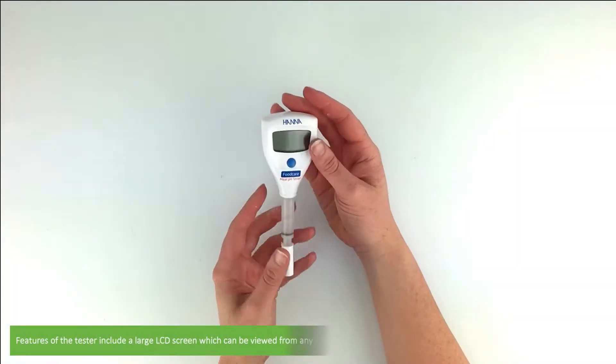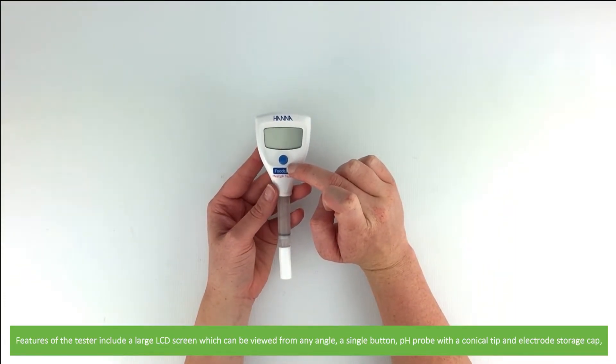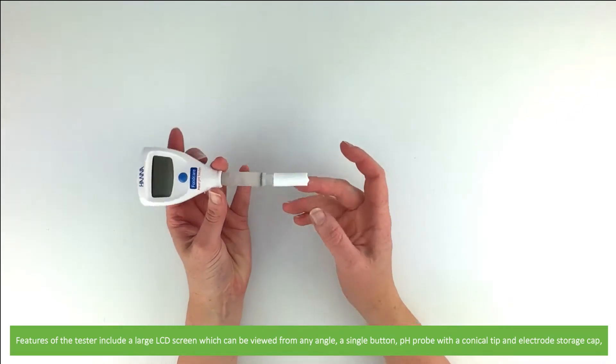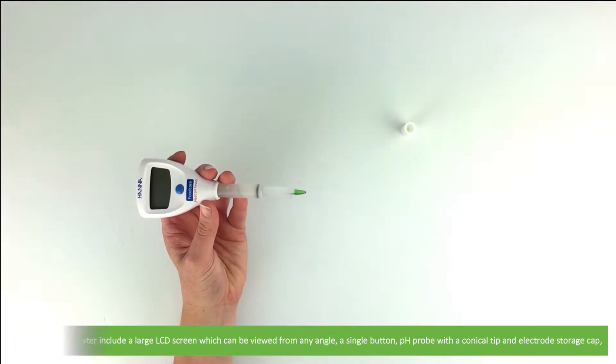Features of the tester include a large LCD screen which can be viewed from any angle, a single button, pH probe with a conical tip, and electrode storage cap.